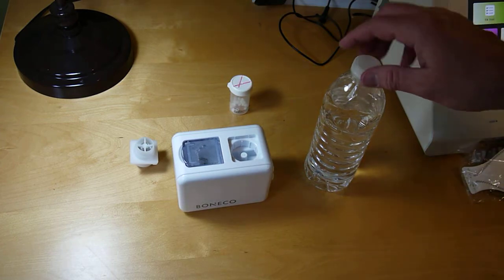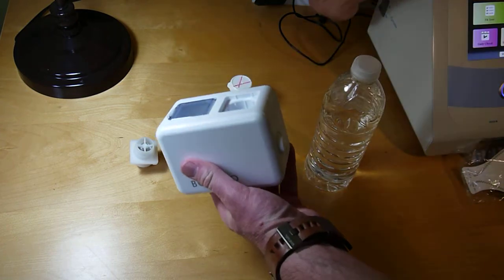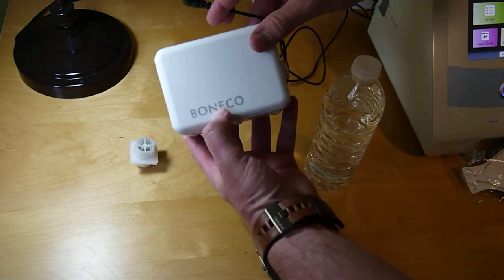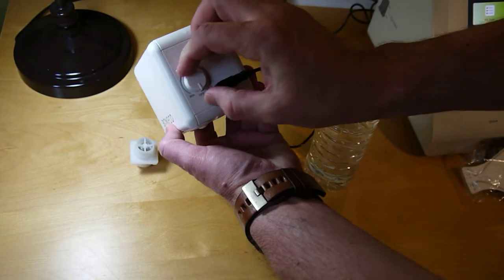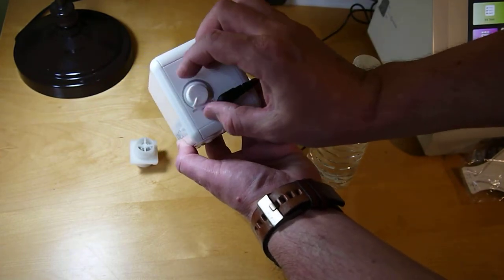To set up the particle generator, first take the power supply that's marked for the particle generator and plug it into the back. This is your control for low up to high.